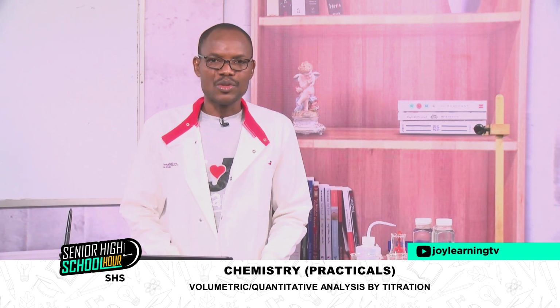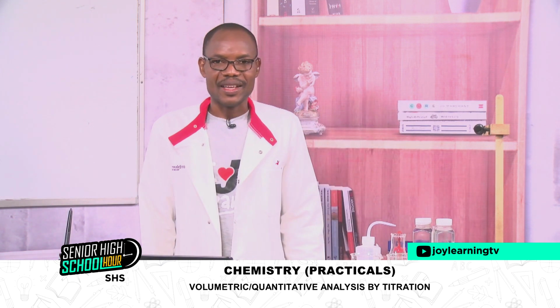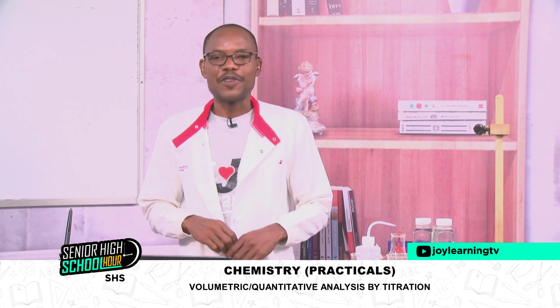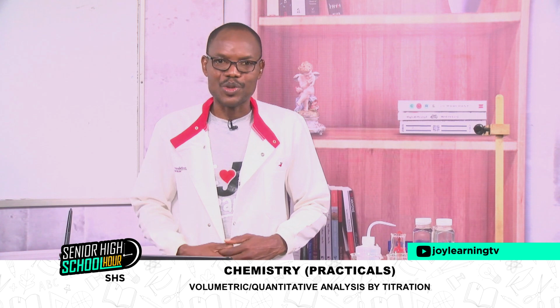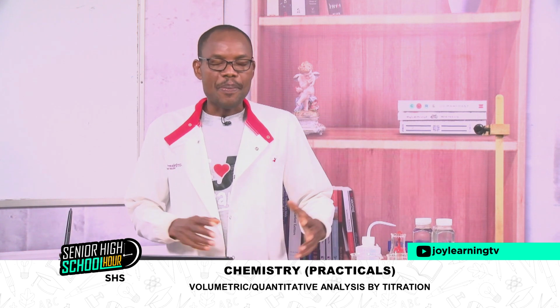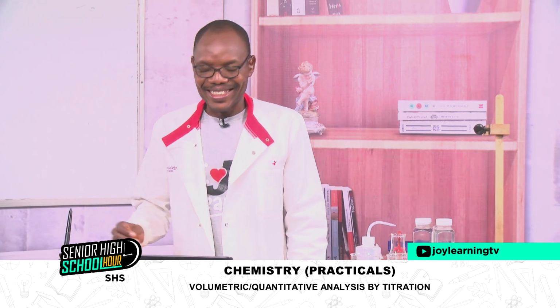Today, we want to look at volumetric analysis or quantitative analysis by titration. So whenever we talk about quantitative, what are we talking about? We are quantifying. It means there are some calculations that we'll have to be doing. But before then, we want to introduce ourselves to the apparatus that we need in this volumetric analysis by titration.